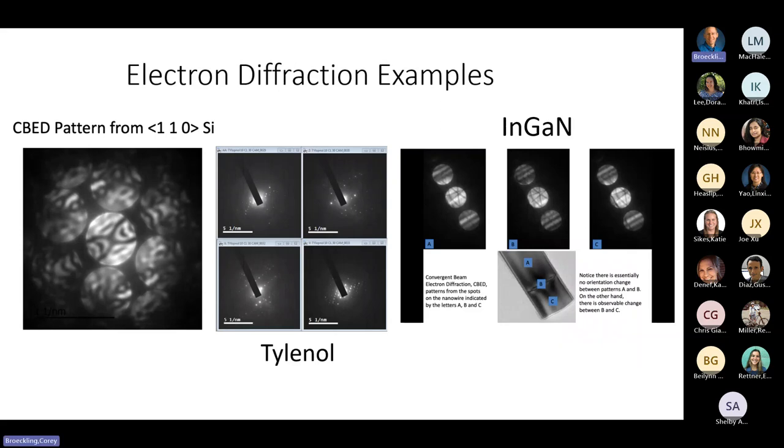Then we have diffraction. We can do CBED, convergent beam electron diffraction. The nice thing about that is it shows you symmetry. You see you have two two-fold axes. It shows you the symmetry of the 110, which is what you expect. So you can actually see symmetry in a structure. It's used quite a bit to sort out the structure of crystals.